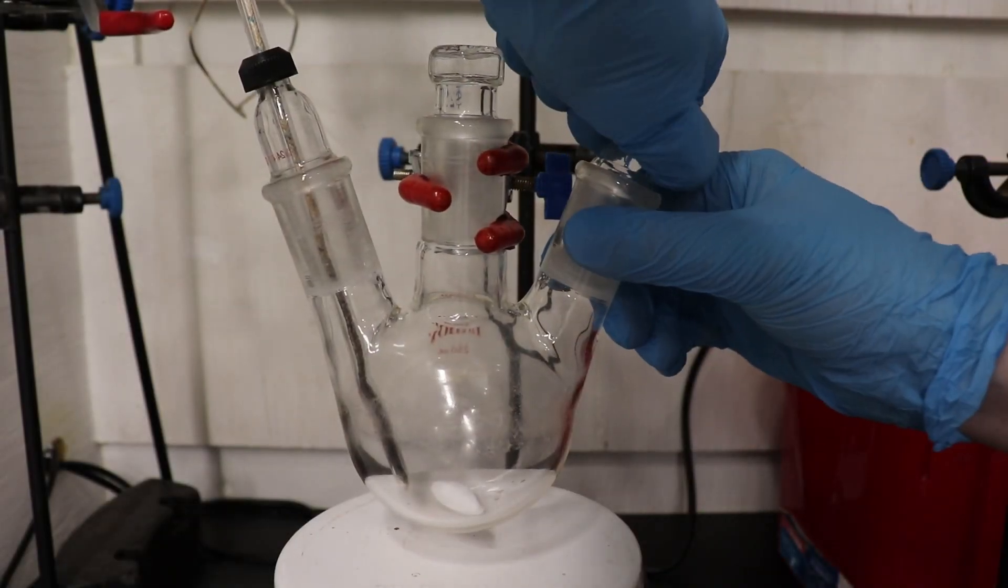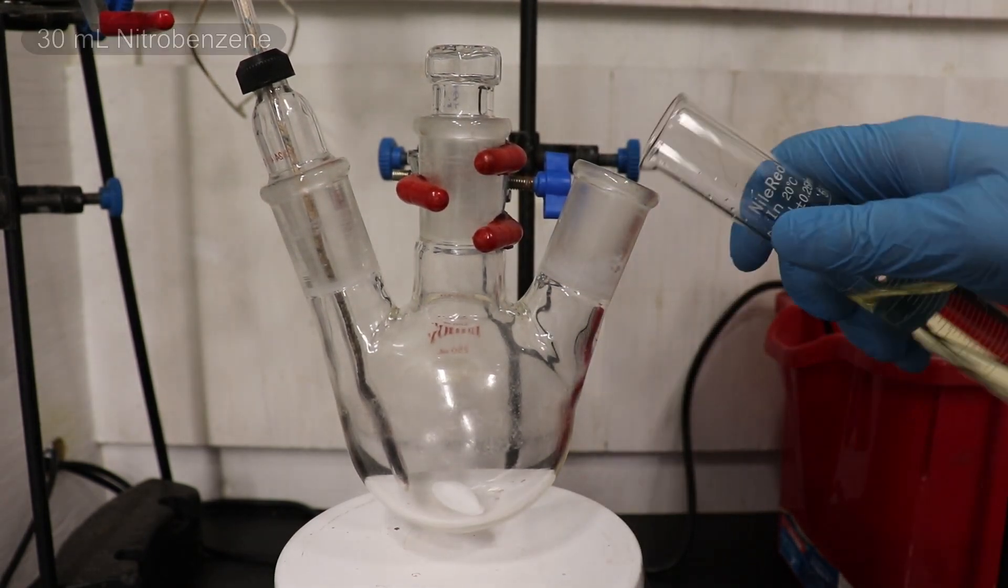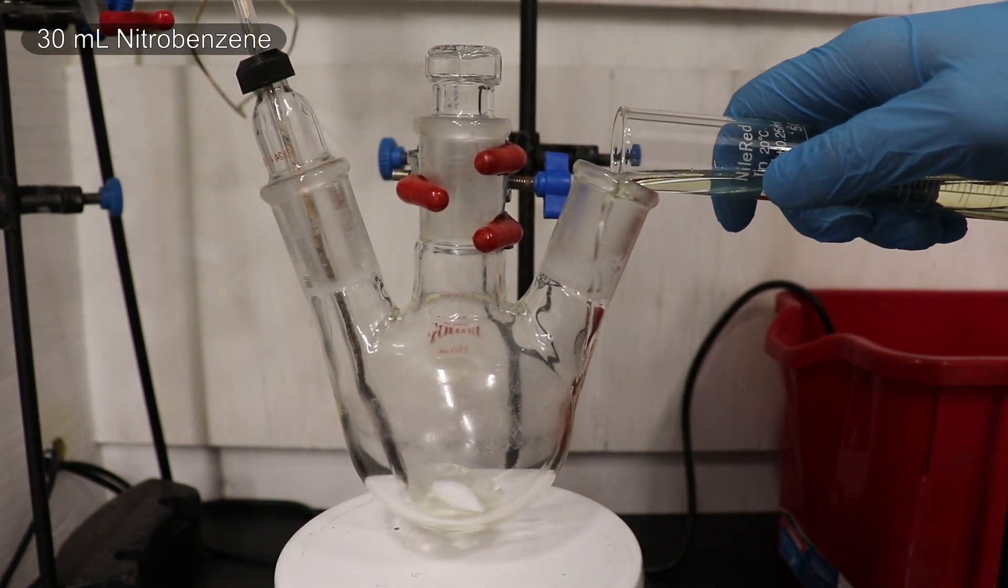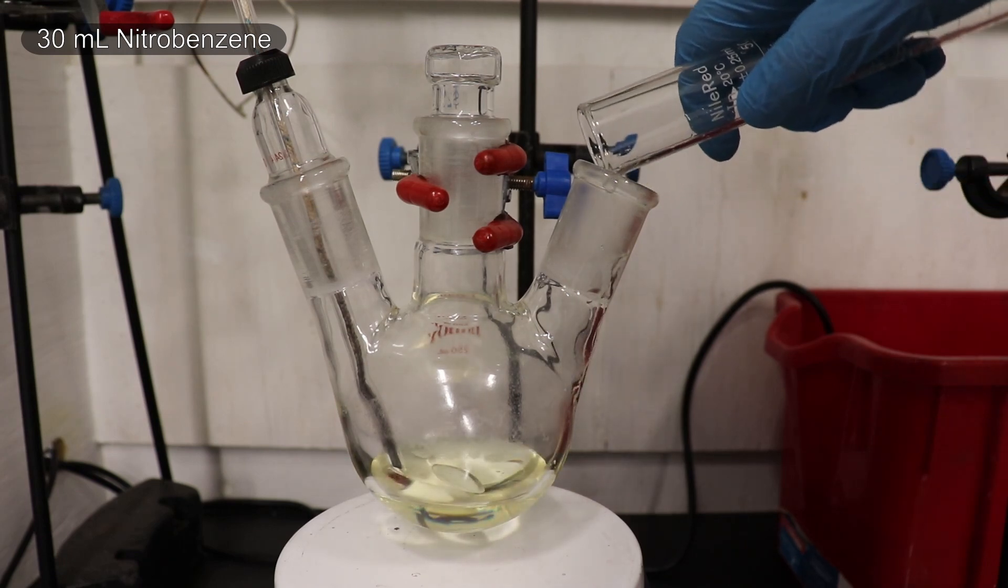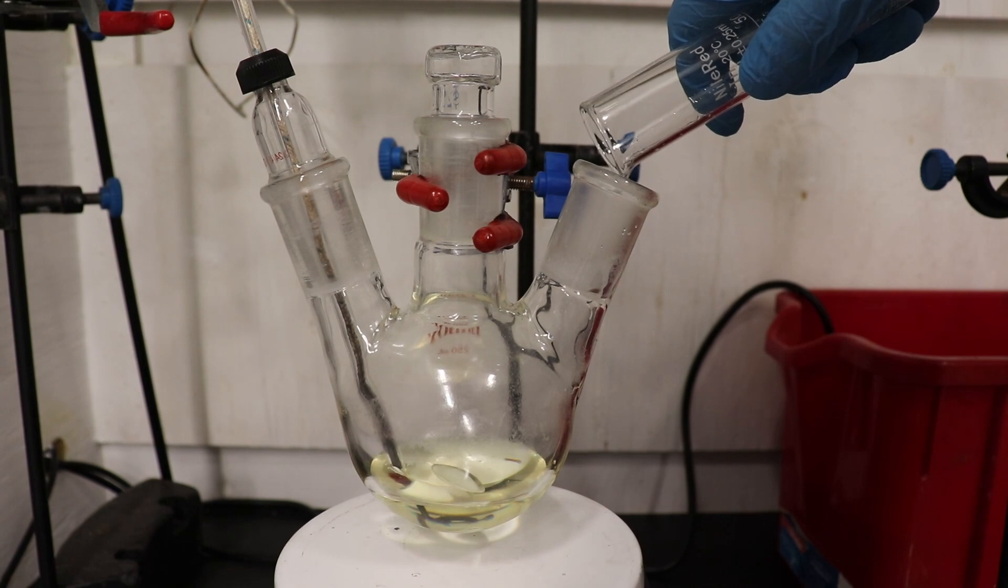For the synthesis, I'm going to be following the procedure as laid out in SIDNAG's Pharmaceutical Manufacturing Encyclopedia. To begin, 30 ml of nitrobenzene is added to a 250 ml three-necked round-bottom flask.